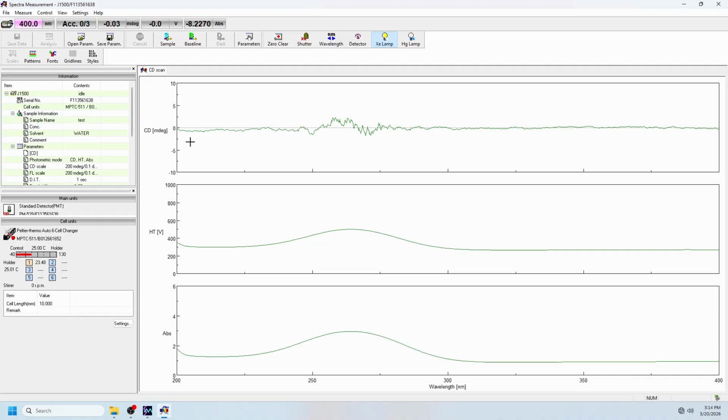Once you've run your sample, you're ready to clean up. You can take a flash drive, and then you can export the data from there. And then to finish up, we want to make sure we collect some data for the logbook.